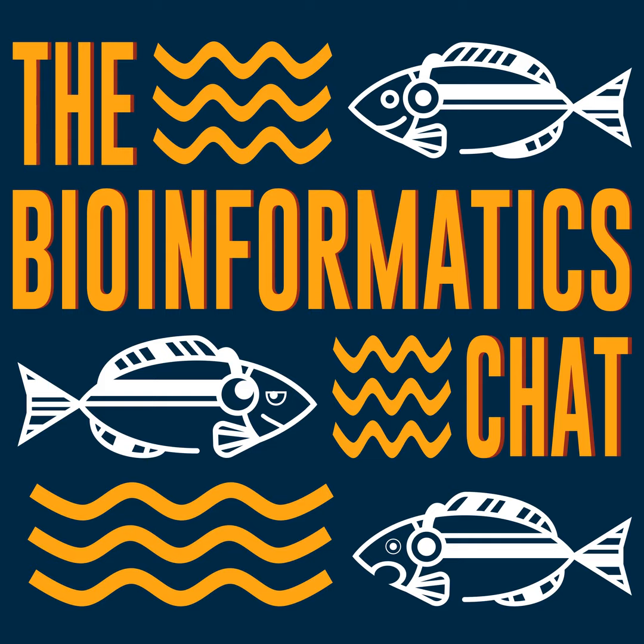Or rather than barcodes, sequence adapters? Yeah, exactly. So this has a sequencing adapter attached to the DNA, which contains the barcode, but it's really the sequencing adapter that is required for it to be sequenced. Otherwise, it flows through so fast that it's hardly a blip in the sequencing machine. It's actually kind of cool to see the difference between DNA that's just passing through and DNA that's actually able to be read.